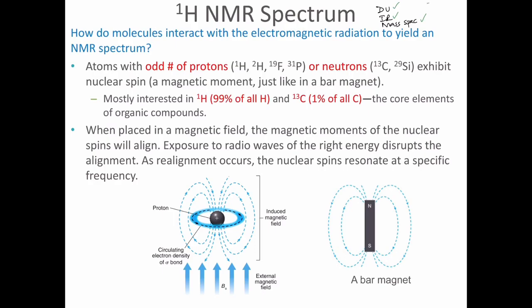However, all these details have not led us to a conclusive decision as to what the actual structure of the unknown compound is. Because of that, I'm going to introduce another strategy, which is called proton NMR. NMR stands for nuclear magnetic resonance.